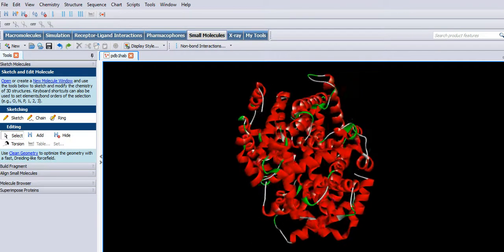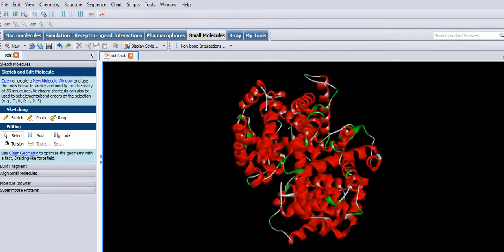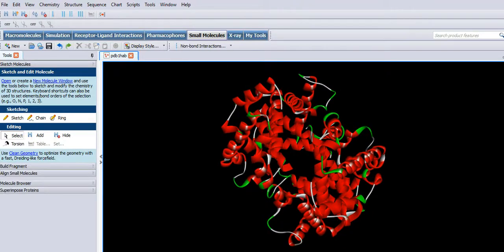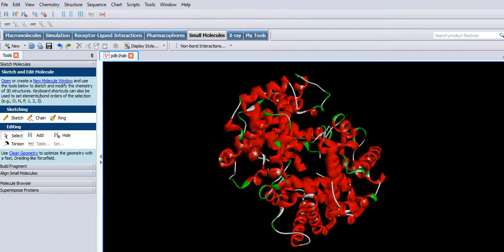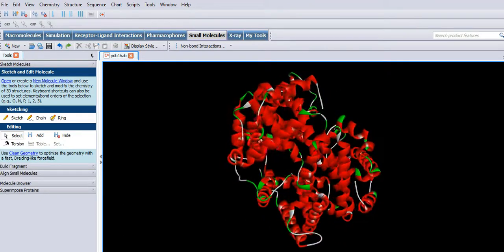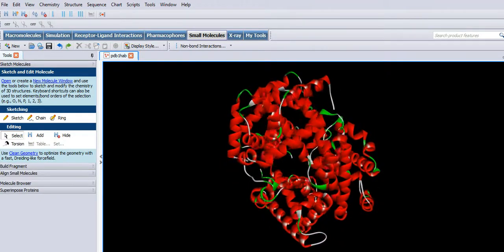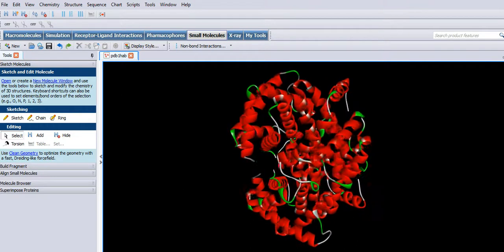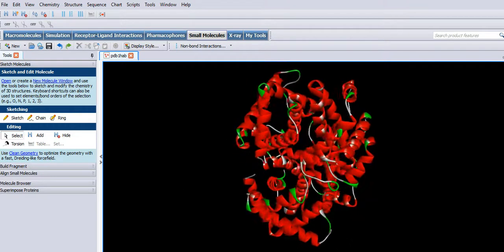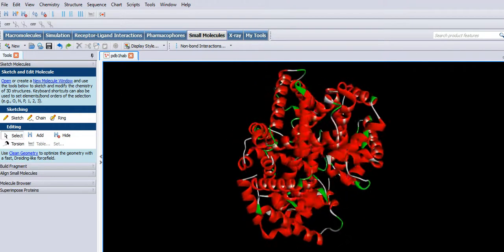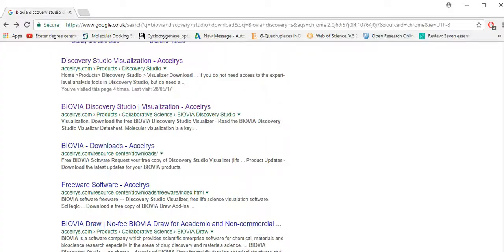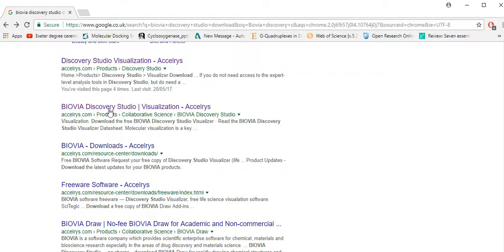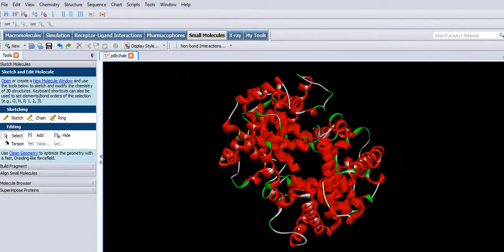So this is Discovery Studio Visualizer. I'm just going to go through some of the simple basics just to get you started. It's a very simple download, although the name is a bit strange. It used to be called Acceleris, now it appears to be called Biovia. Anyway, that's the download that I used and it opens up like this.